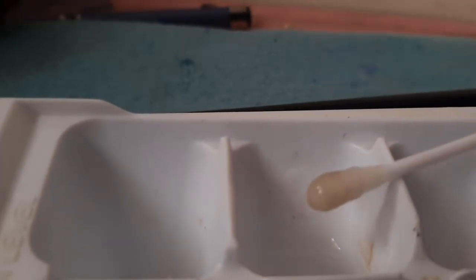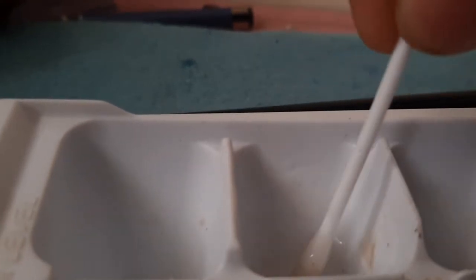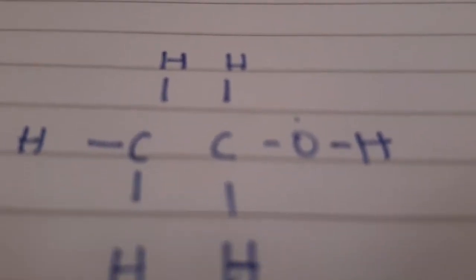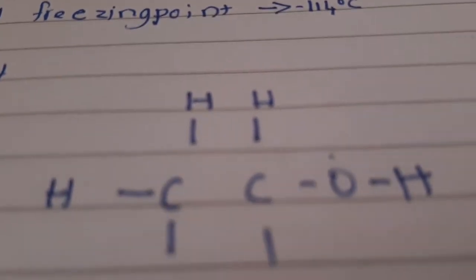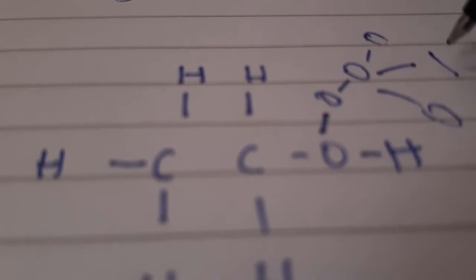Let us mix it up a little bit. And this is a normal cotton, and you can see that it is weird. All the edges are a little bit brown. That is because of the flame. So when ethanol reacts with oxygen, it becomes two molecules. So here is my theory, it becomes like this. If we have two O's or one over here, it must be changing to another O, because it is reacting with oxygen. It can also be like many ones over there, or if you add hydrogen, it will be like this one or like this one over here.